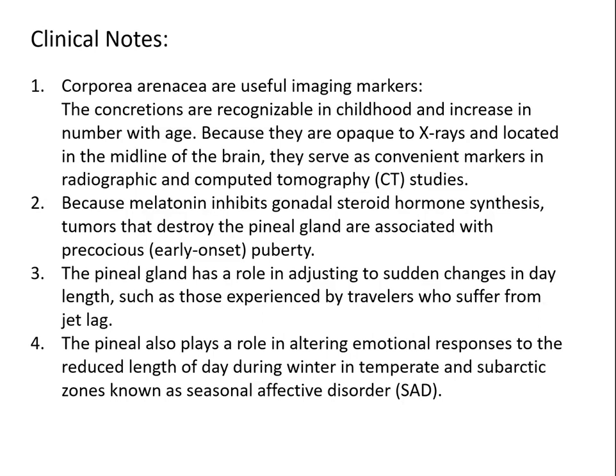Just a couple of clinical notes. Those brain sand or corpora arenacea are very useful in imaging clinically. The concretions are recognizable in childhood and, as I said previously, increase in number with age. They are opaque to X-rays and located at the midline of the brain. Therefore, they serve as convenient markers in radiographic and CT imaging.